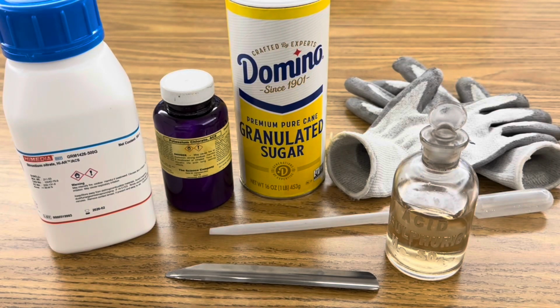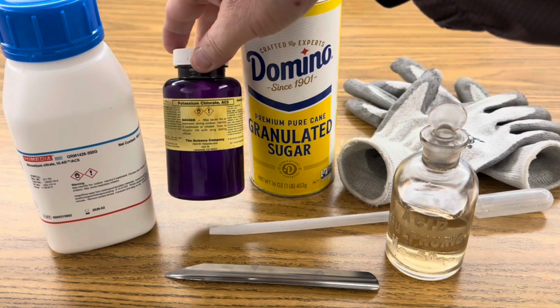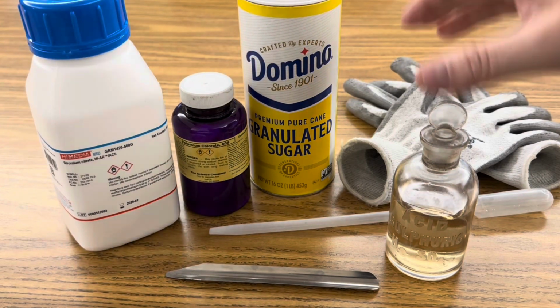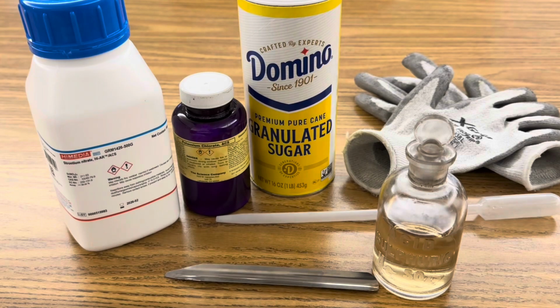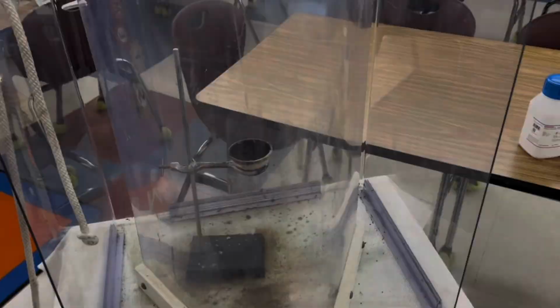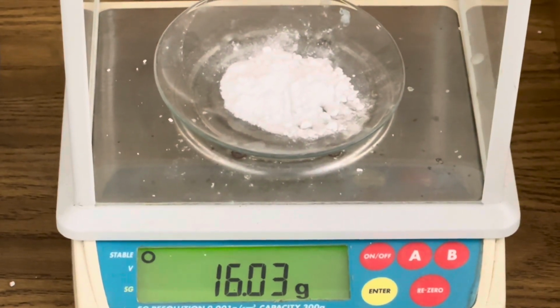To create my roadside flare, I'm using granulated sugar as the fuel, potassium chlorate, and strontium nitrate as oxidizers. I'm using 18 molar sulfuric acid as the catalyst, a dropper, gloves, and of course my glass shield to contain the reaction. The first step is to measure out 16 grams of potassium chlorate.